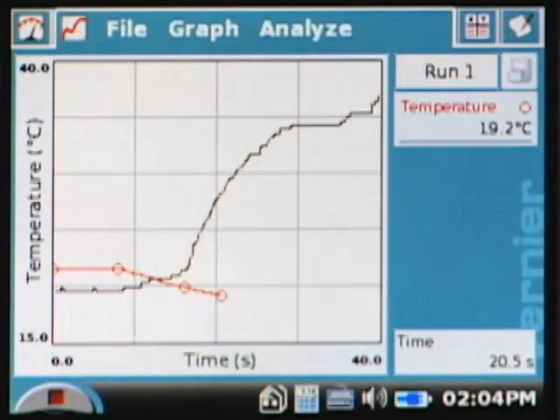It did not go up as my prediction said it would do - it actually went down. So it was cooling off. I guess that's why they named the lab the cool reaction. It's almost finished data collection there, and 40 seconds is up, and it stopped collection.